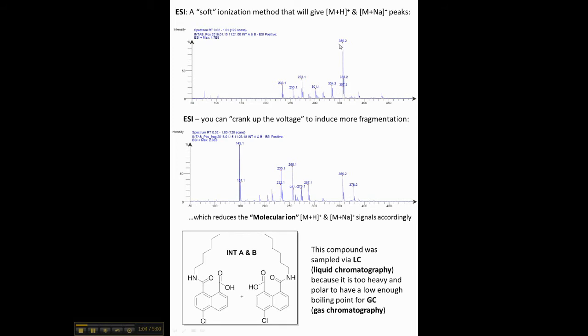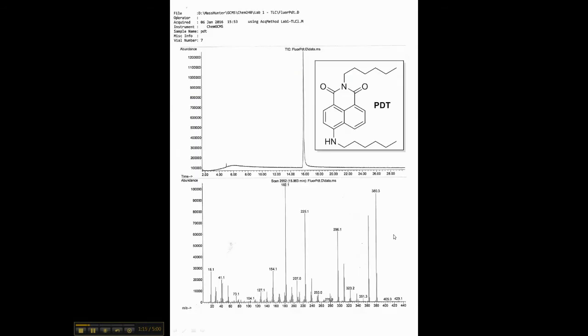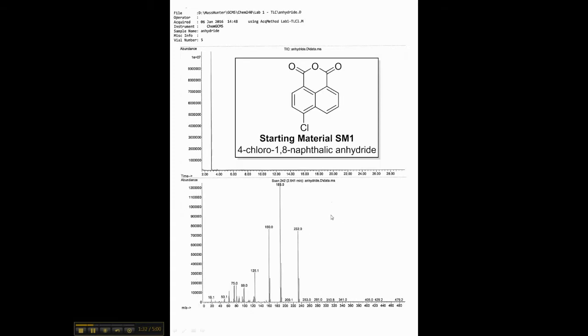With ESI, this is a relatively minor component of the information. You care mostly about these two peaks over here on the right. But with gas chromatography mass spectrometry, GCMS, we're using a different ionization method, and the compound will tend to fall apart. So there's information contained within this peak on the right, and the fragmentation pattern that you see all throughout also contains some information. To a first approximation, though, the information I really want you to take away from a GCMS or an ESI mass spec is: what is the peak that's the furthest right, and does that make sense?